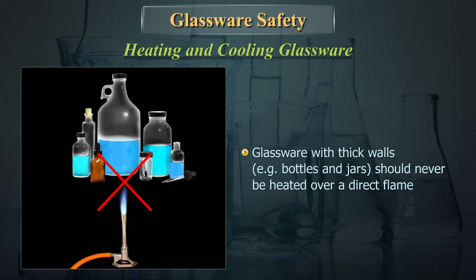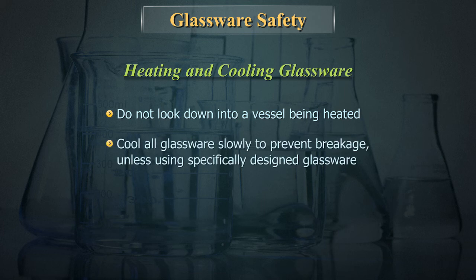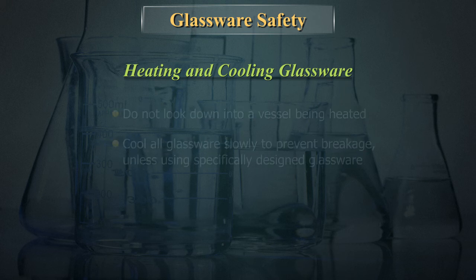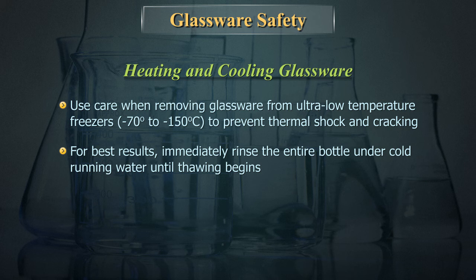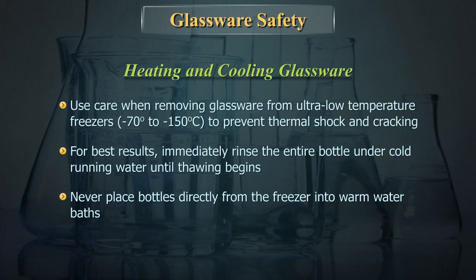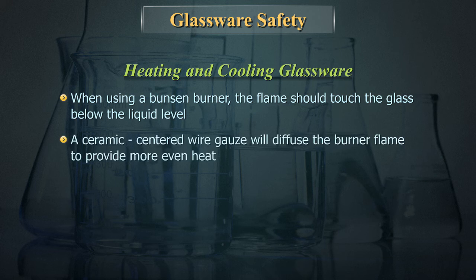Glassware with thick walls — for example, bottles and jars — should never be heated over a direct flame. Do not heat glassware directly on electrical heating elements. Do not look down into a vessel being heated. Cool all glassware slowly to prevent breakage unless using specifically designed glassware. Use care when removing glassware from ultra-low temperature freezers to prevent thermal shock and cracking. For best results, immediately rinse the entire bottle under cold running water until thawing begins. Never place bottles directly from the freezer into warm water baths. When using a Bunsen burner, the flame should touch the glass below the liquid level.